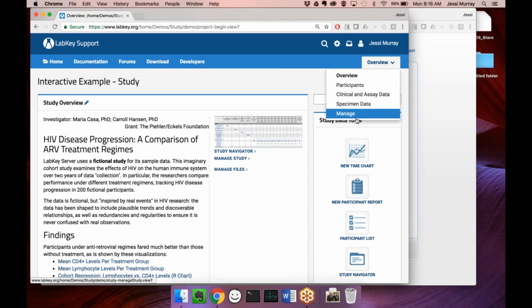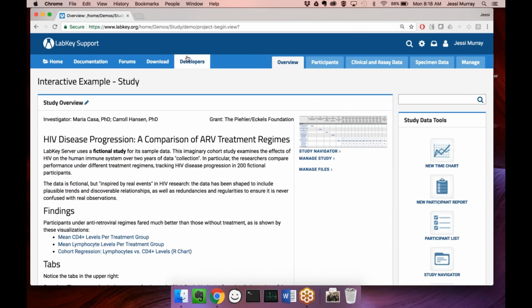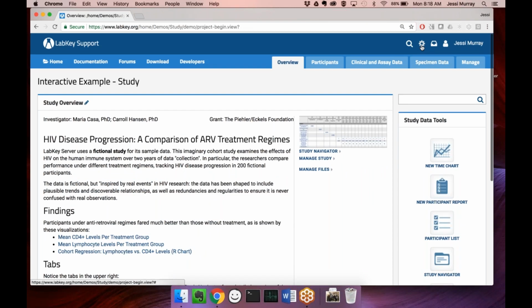So we still have the ability to get to all of your tabs when things are collapsed. You still have the ability to set your custom menus if you want, and all that. We just wanted to make sure that we handled it in certain cases elegantly.